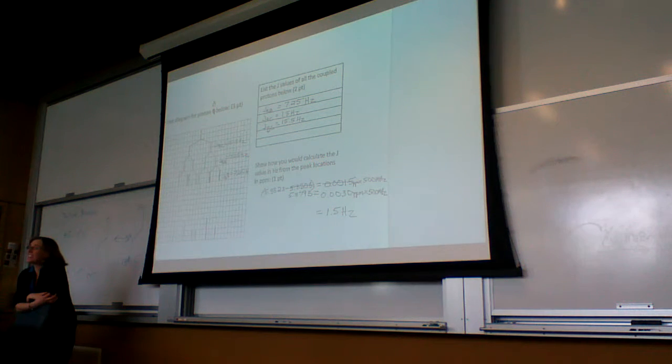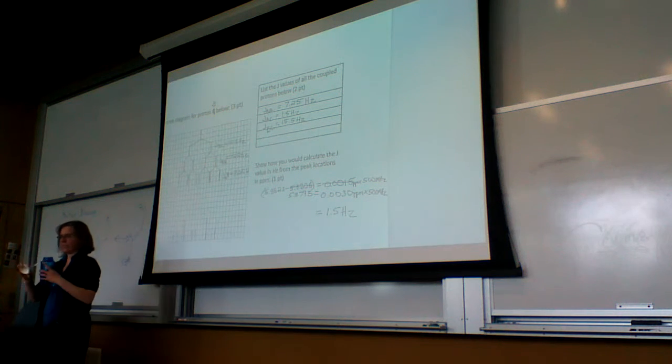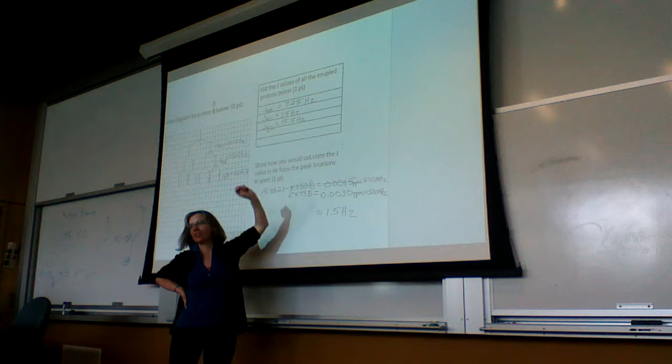Let's practice doing this. Is it getting a little bit better? Yeah, I need to do that one. Yeah. I have a hard time looking at, not the NMR, but the J coupling ones, and having a pattern in my brain of, let's do this first and see what couples to this first. I think I just get lost extracting out these numbers.